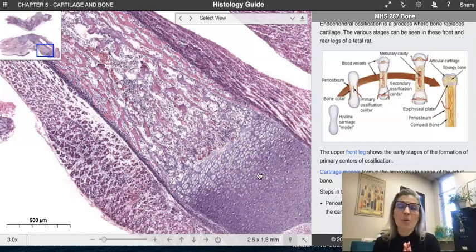Again, it's important to remember that this is endochondral ossification, but not just anywhere. We have endochondral ossification in a lot of bones. It works just like this. You could see the same growth pattern if you were to look at your intervertebral disc slide, right? We went to intervertebral disc to look at fibrocartilage at the disc, but right on either side, flanking that disc, you also have your bone vertebrae. And so at that transition of cartilage to the bone vertebrae, you can actually see this happening, because that's endochondral ossification as well.